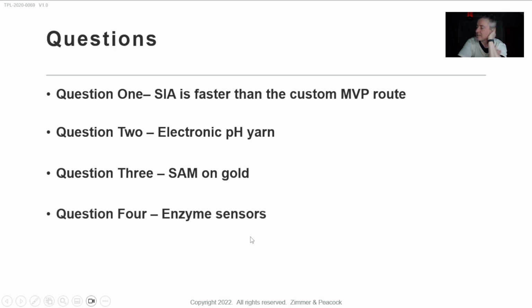The enzyme sensors, I didn't give you a great answer, but something that occurred to me as I was running out of time was that lactate oxidase papers are a good place to go looking. Platinum will work, but with oxidase and reductase it does not scale well in cost. I would use a mediator like Prussian blue, which turns carbon essentially platinum-like.